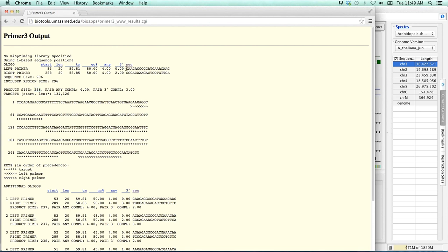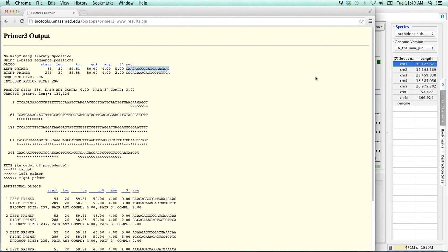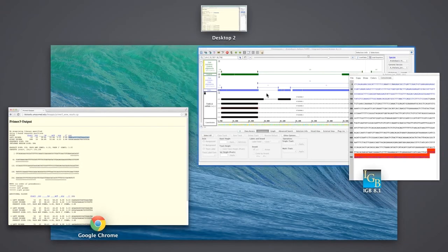So as good as this is, what we really want to be able to see is a visual analysis of where those primers are, how they fit into our analysis of alternative splicing, and make sure they're facing in the right direction. So what we want to do is I'm going to select this first primer, going to copy, and let's jump back into IGBE.